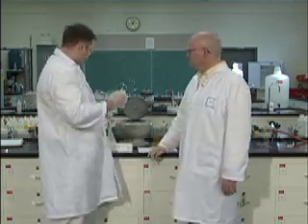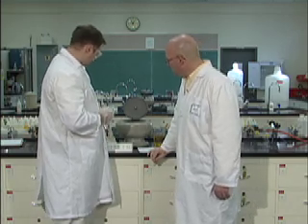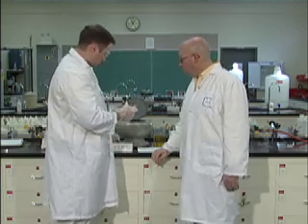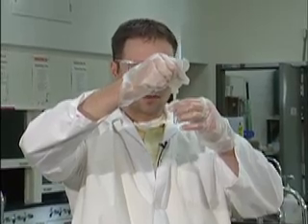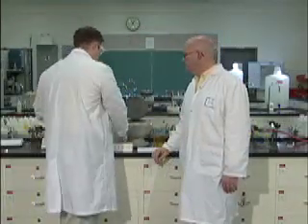So to our solid, we're going to add ammonium hydroxide. Just drop by drop, and be generous with these, because remember, it's qualitative analysis, which means we need to discover what's in here, not quantitative, not how much.